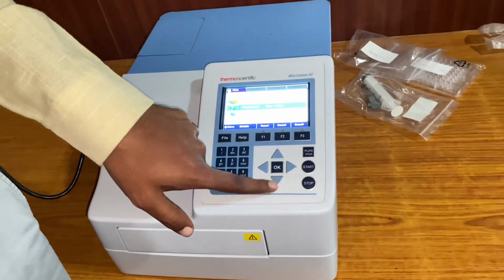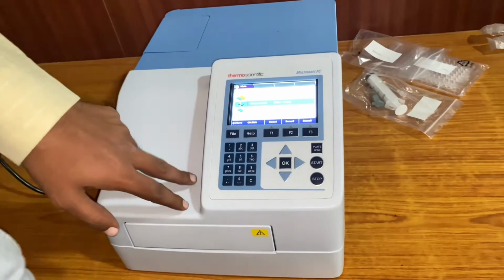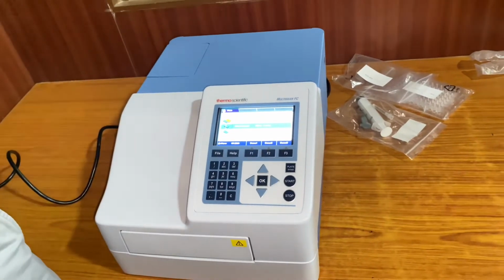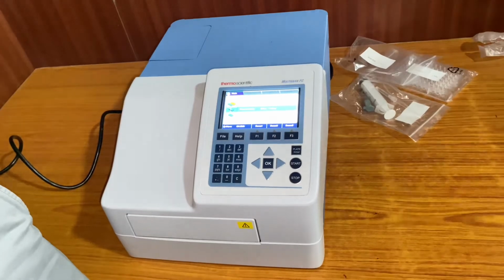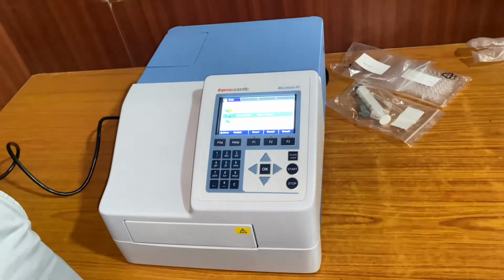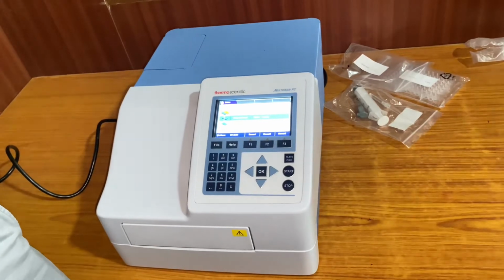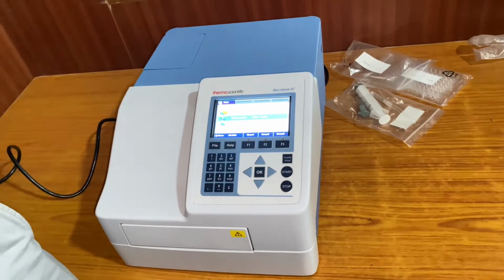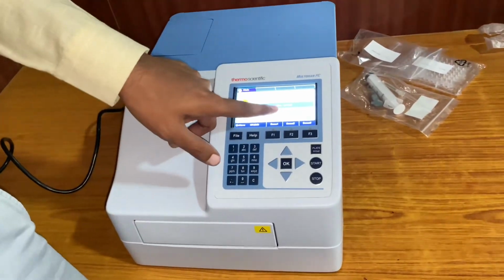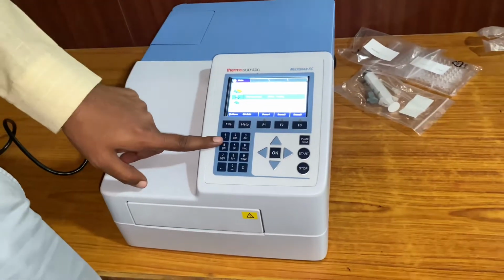Which readings for what depends on the kit which you are running. For different parameters, there may be different wavelengths. Normally the common one is 450, the majority of the parameters, 405 also. So based on the kit you have to choose which wavelength you need to take the reading. Now as an example I took 450.